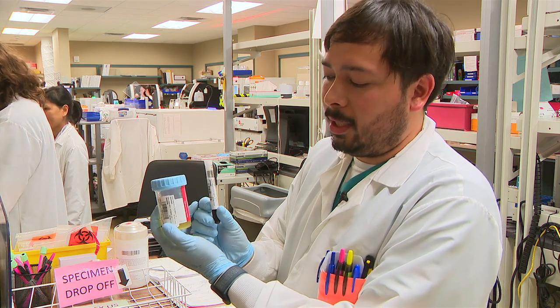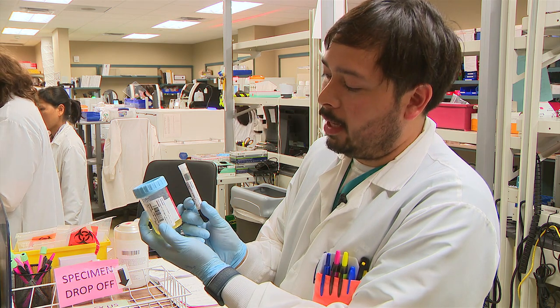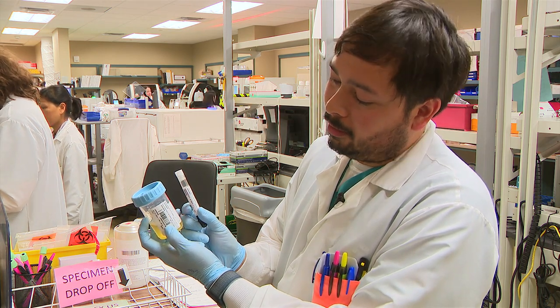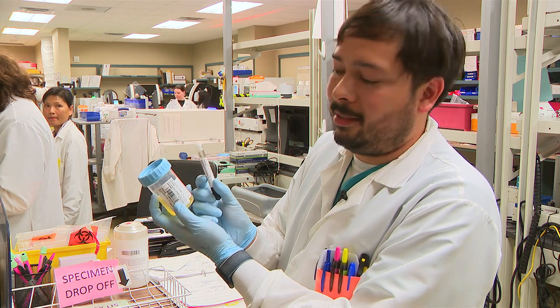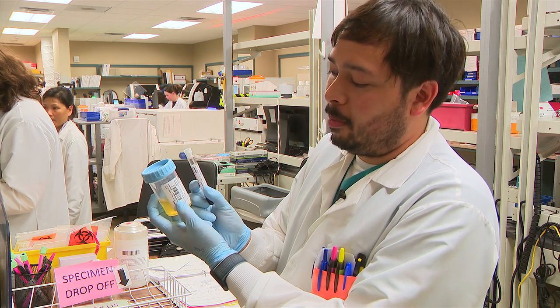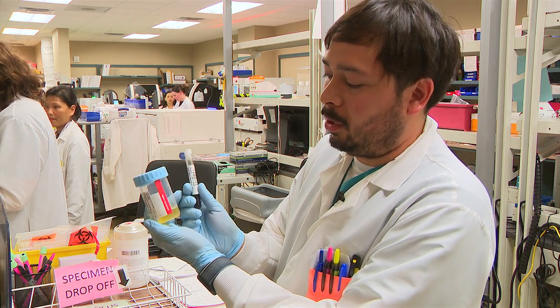These are two specimens that we'll be using today. We have made special fake patients for this, so everything that you'll see here is not real patient demographics, but it is real samples.